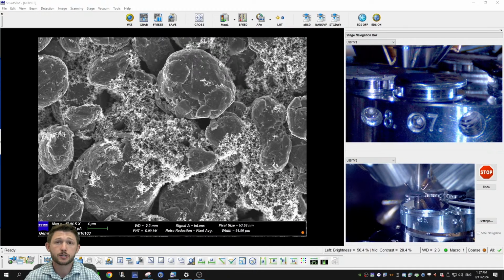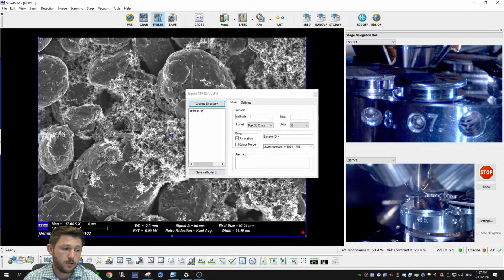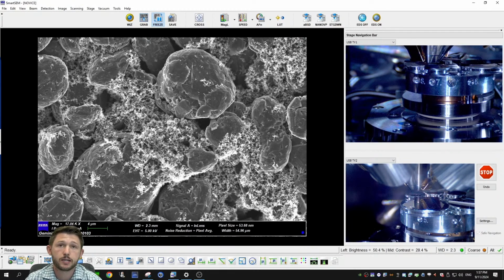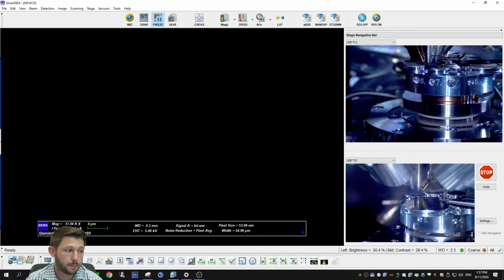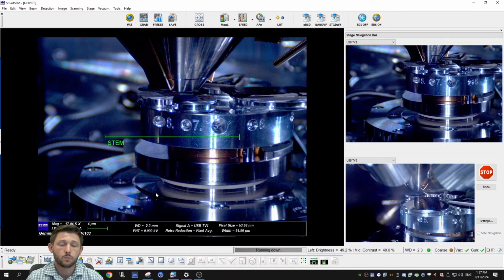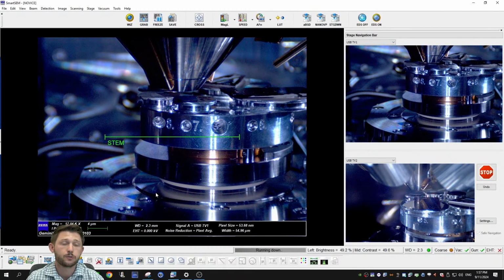When it comes to exchanging the sample, there's a very nifty shortcut that exists on the control panel in front of the microscope. So a user just needs to click that exchange button, which you'll see after this save. And it will drop the stage, turn off the beam, close the isolation valves, and drive the stage back to the exchange position. So this whole novice interface that you see here is designed to make the workflows simple, straightforward, and safe for beginner users.